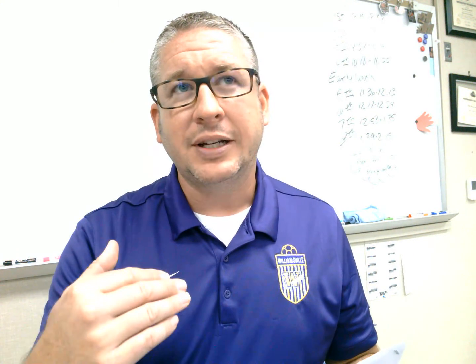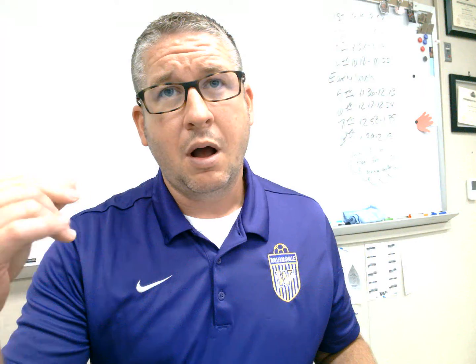The lab itself doesn't take very long to get going, especially that I've got things already set up, ready to go. I'm going to do my best to help you observe as I go through this here. I'm going to try an approach this time where I am going to kind of get you started, okay? And I will work through it, but I'm going to have you make the readings after our initial reading, okay? And you're going to follow along with me as we document this. We're going to fill out the data table, and after I fill out the data table, I'll describe to you what you need to do from that point forward, okay?